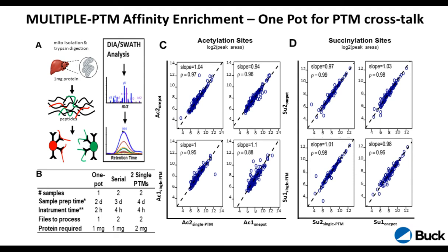One advantage is that if we are using samples like mitochondria from mice, or maybe the cortex or the striatum of a Huntington's mouse, sometimes you're actually rather sample limited in the starting material. So the one-pot enrichment really allows you to start with one set of starting material and then do all your enrichments just from that. That has been a big advantage in the lab, but of course it also cuts instrument time in half and sample preparation in half.